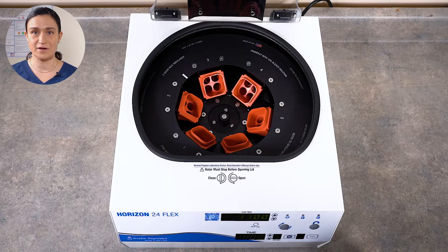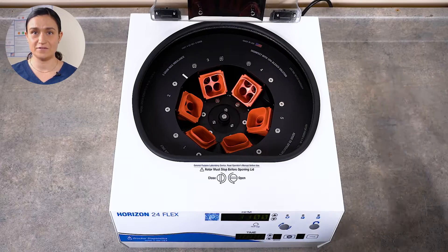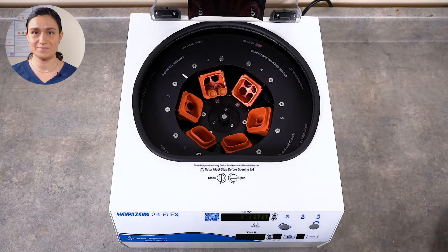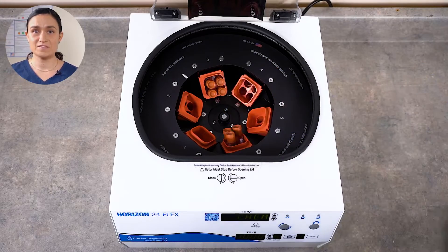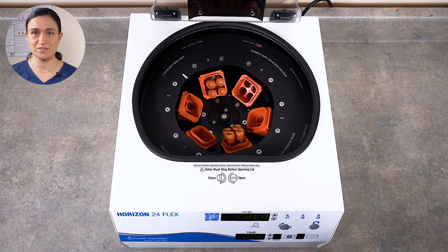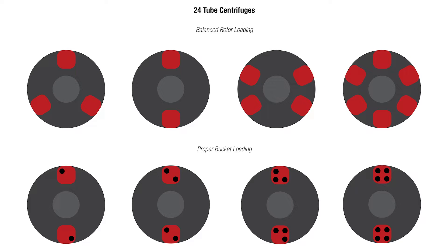Let's start by balancing around the rotor and then adjusting placement within each tube holder as needed. To be balanced around the rotor, each tube holder must hold a tube or tubes of the equivalent size and fill volume as the tube or tubes loaded in the tube holder across from it. So if you've got four 10 ml tubes over here, you need four 10 ml tubes over here as well. If you've got an uneven number of tubes, don't worry — we'll explain what to do about that in the next step. With this loading guidance in mind, start distributing your tubes into the tube holders. You can use two, three, four, or six tube holders, depending on how many tubes you are spinning. Just remember to make sure the tube holders are carrying equivalent weights. Once you've got that equivalent loading, follow the diagram on your screen to balance the equally weighted tube holders around the rotor.